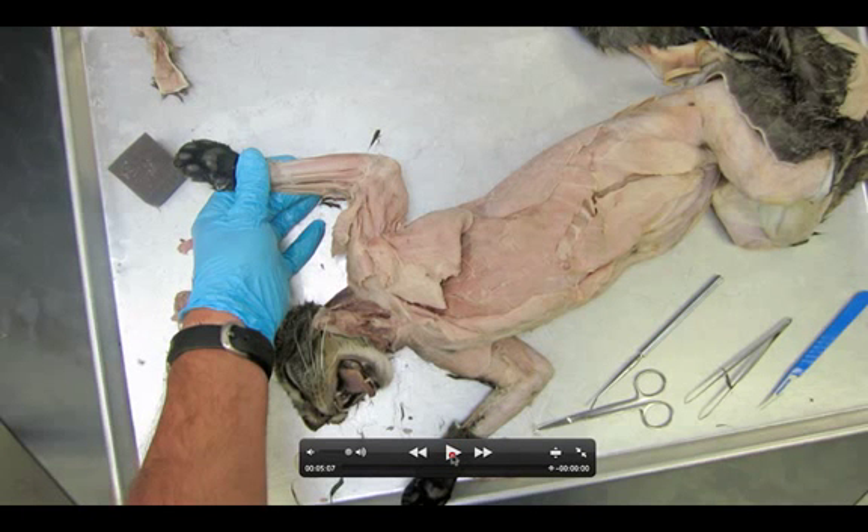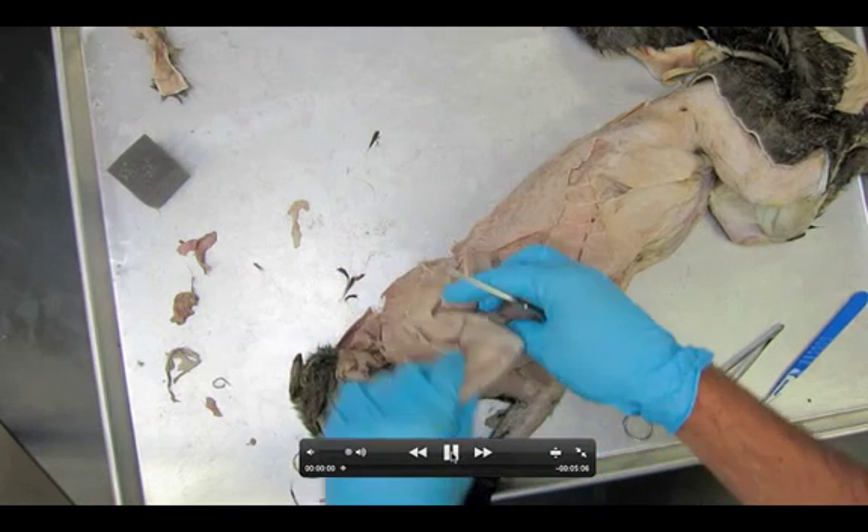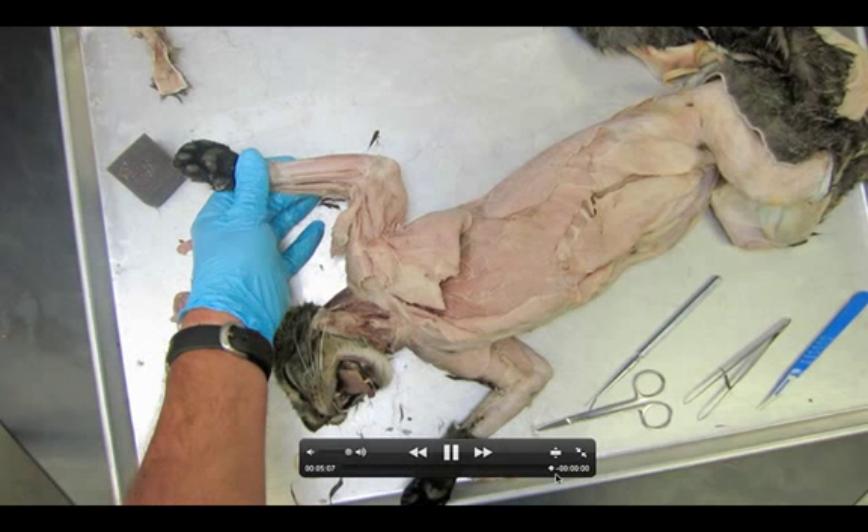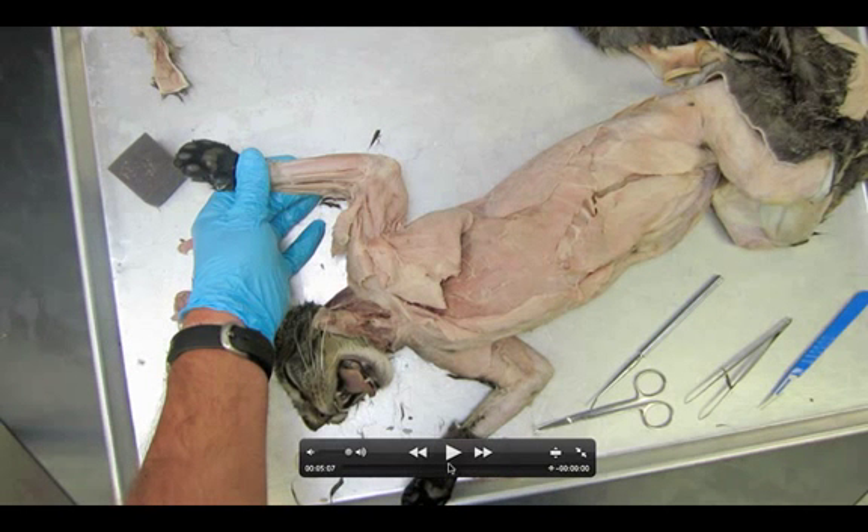Taking a look at dissection number nine: the superficial muscles of the arm on the medial surface. Let's start at the very end of the video for a quick overview. The muscles we should be able to see are the extensor carpi radialis, the pronator teres, the flexor carpi radialis, and the palmaris longus.